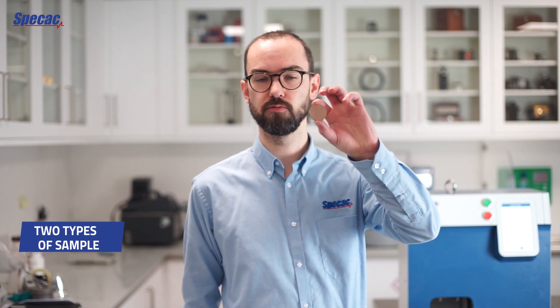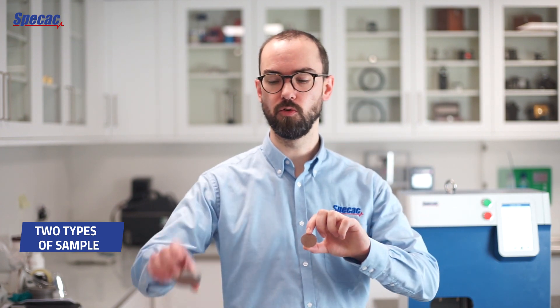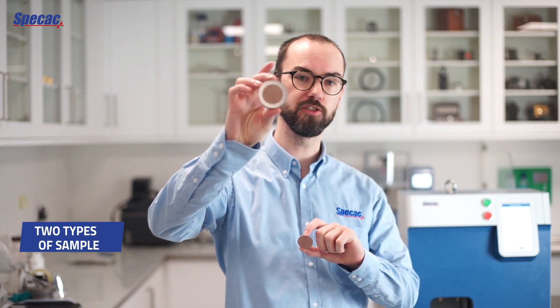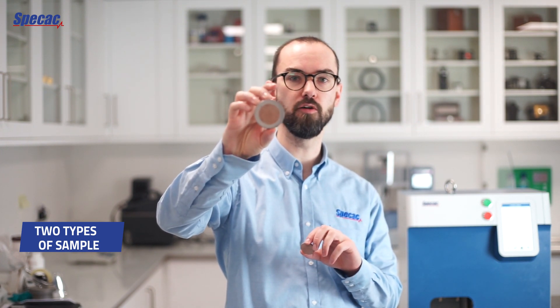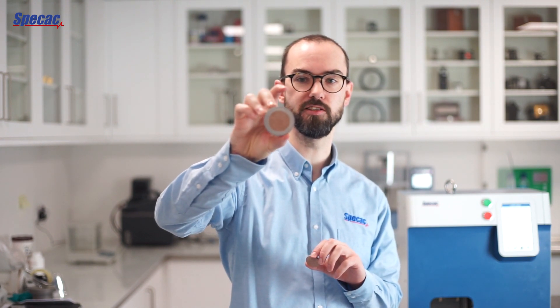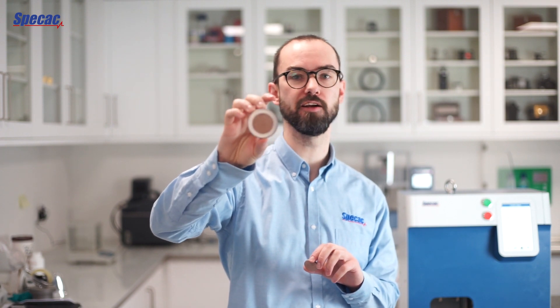There are two types of sample that you can press in the APEX 400. You can either press free samples in a standard pellet die, or you can produce your samples in steel supporting rings. The advantage of the latter is that these steel supporting rings are very easy to place and move into the pellet die, and they halve the number of steps required to produce a sample. So you can produce batches by having multiple rings and breaking the samples out after a batch has been produced.